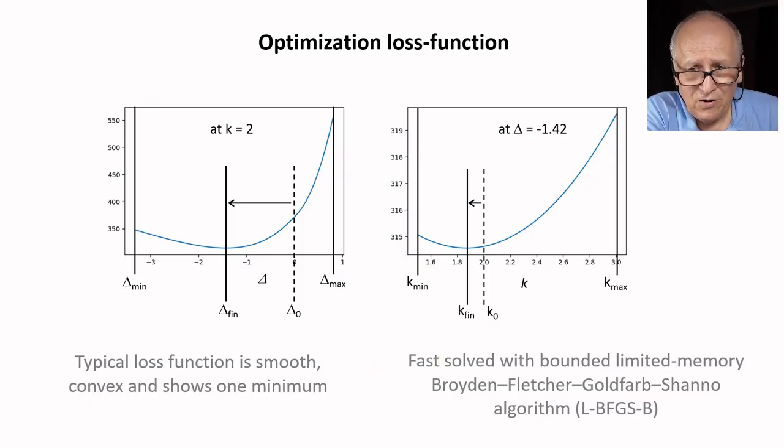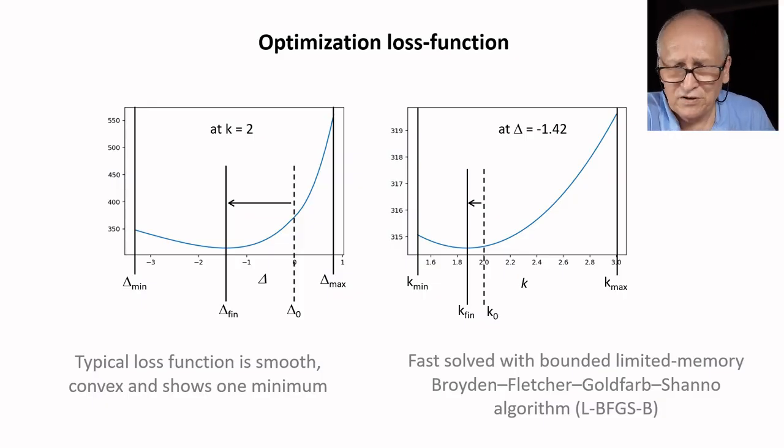But still, of course, the fitting procedure is noticeably slower than linear fitting algorithms. Mainly that is because of overheads. Probably we can further optimize that by optimal compiling of the whole procedure. But for the moment, it's noticeably slower than the linear fit.